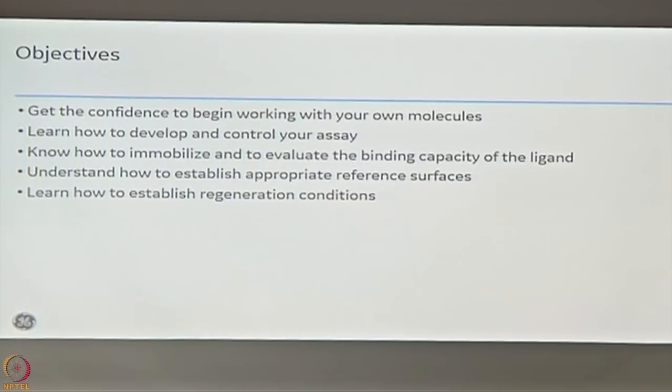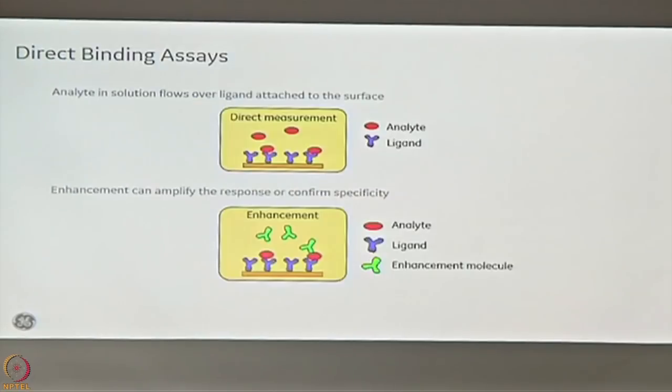How do you optimize the regeneration condition, because if your regeneration is not perfect, your runs typically do not go so well, right.